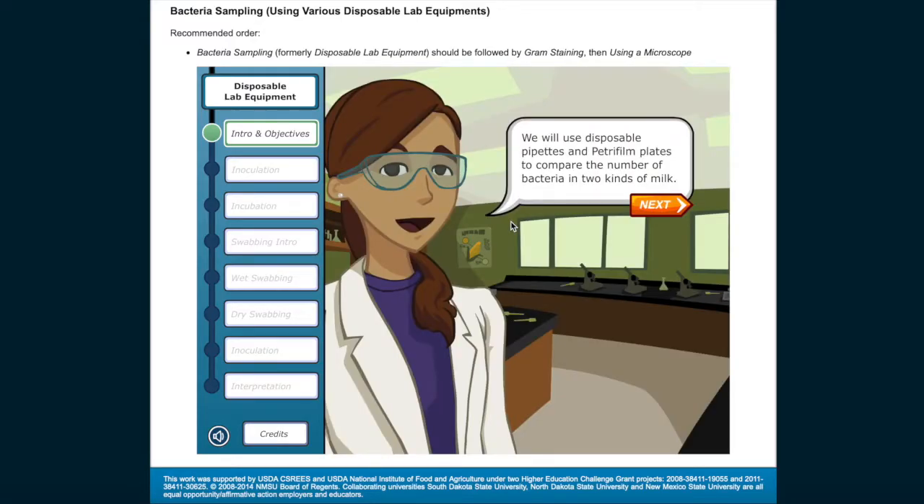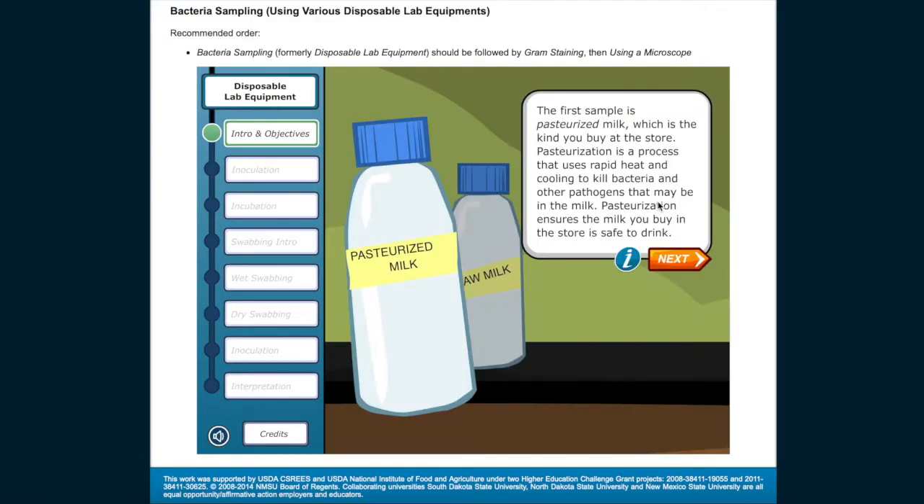We will use disposable pipettes and Petri film plates to compare the number of bacteria in two kinds of milk. The first sample is pasteurized milk, which is the kind you buy at the store. Pasteurization is a process that uses rapid heat and cooling to kill bacteria and other pathogens that may be in the milk. Pasteurization ensures the milk you buy in the store is safe to drink.